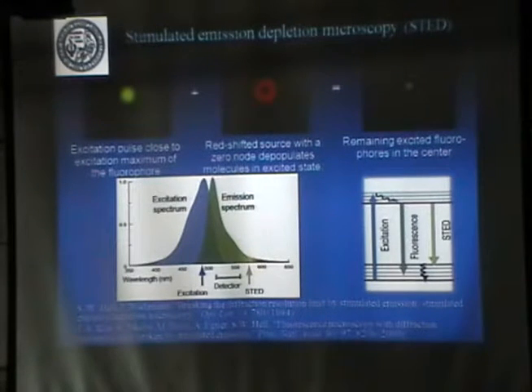Who talked about confocal? Confocal microscope. Normally in confocal, you scan a spot and then have a pinhole detector. Now, the smaller spot you can generate depends on the wavelength. So how do you do that?